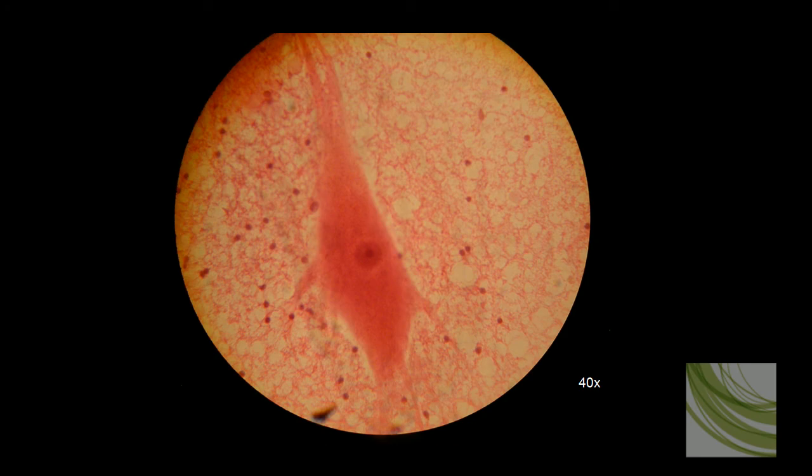To finish off this slide I want to show you a 40x magnification, or rather a magnification using the 40x objective. Of this large cell body here we can see some dendrites. Looks like this would be the axon hillock. There's the nucleus and nucleolus and it looks like we've got an axon coming off of this axon hillock.